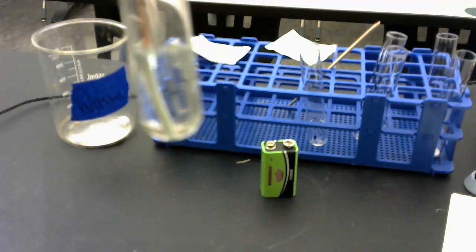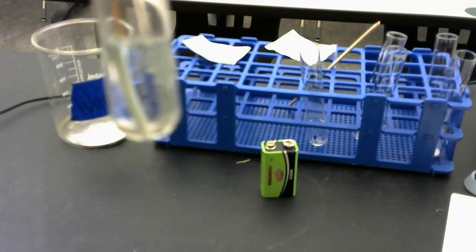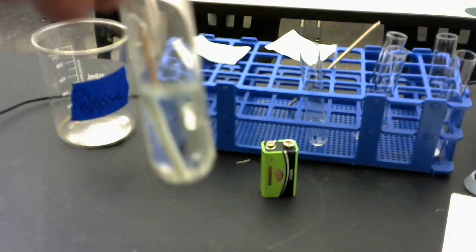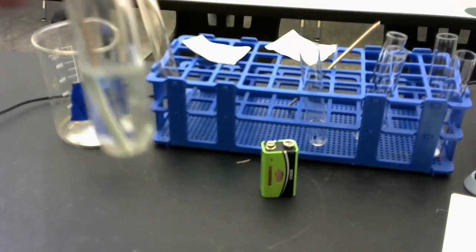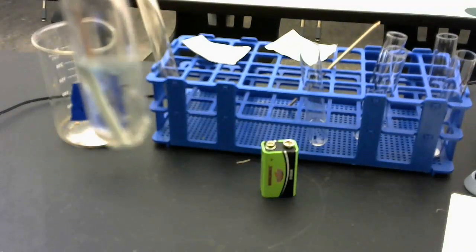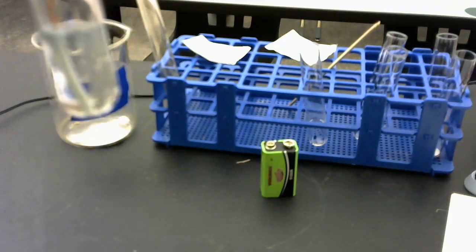And I'm going to let that react for a little bit and come back to that so you can see just how much of that solid is being produced. And if you think about it, okay, so I've got silver nitrate, AgNO3, reacts with copper solid to produce. Well, what's happening? This is a single displacement reaction. So our metals are going to displace each other.